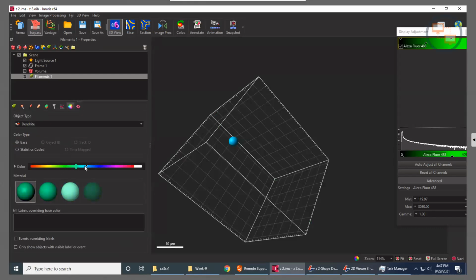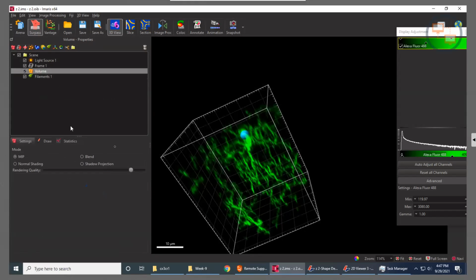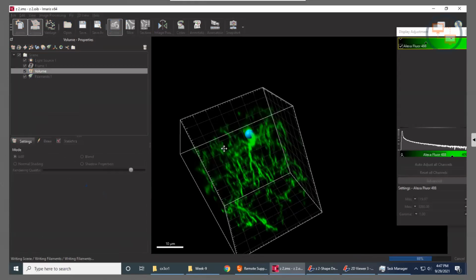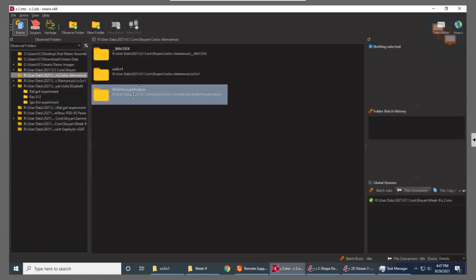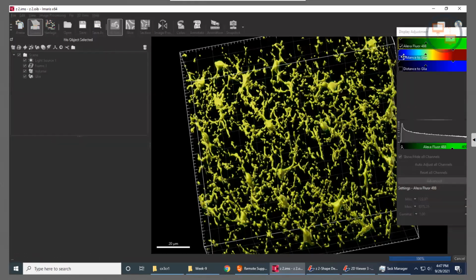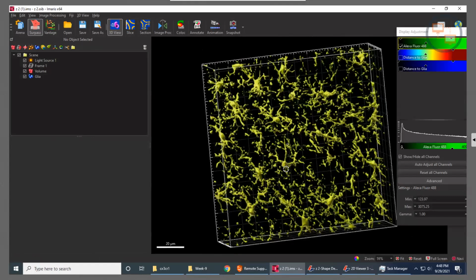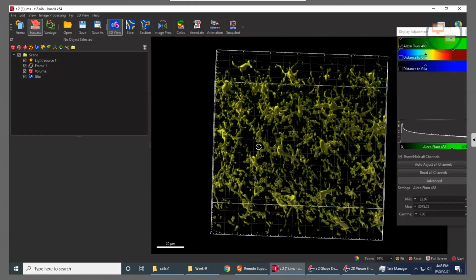That's interesting. That's odd. For some reason, it wasn't showing up previously, but it would.